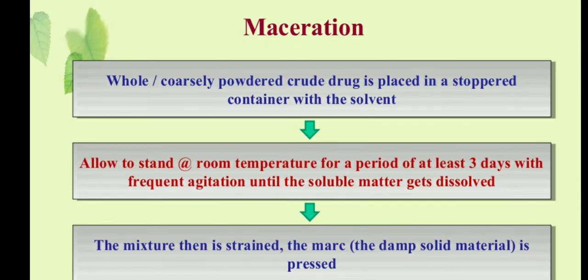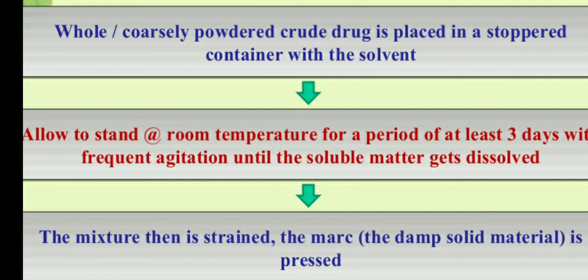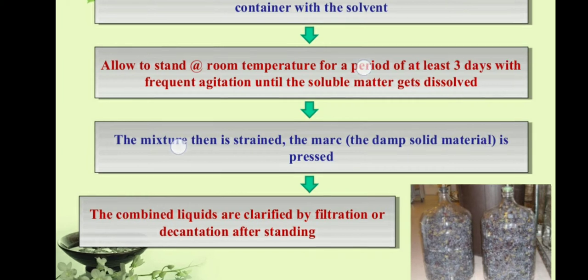Another method is maceration. In this method, whole or coarsely powdered crude drug is placed in a stoppered container with the solvent, and allowed to stand at room temperature for a period of at least 3 days with frequent agitation.